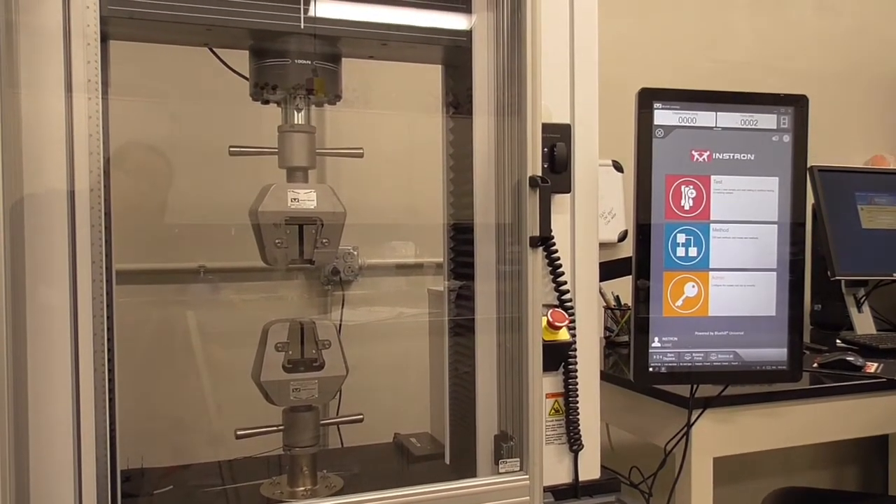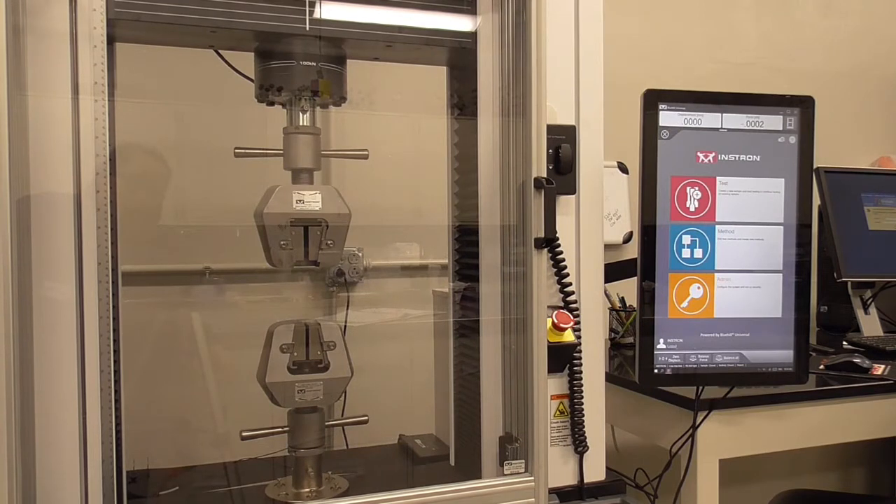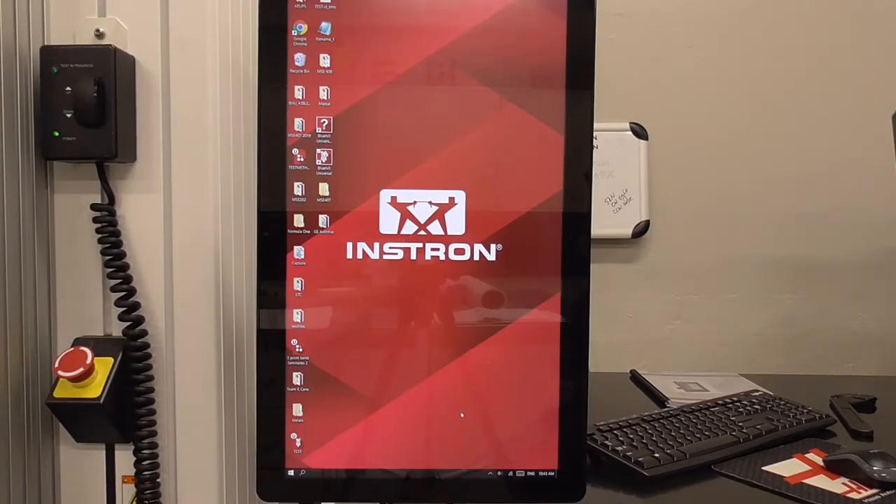This is how you should find the machine for the 202 lab with the grips installed. The machine is calibrated and ready for testing. The software control should be on this screen.